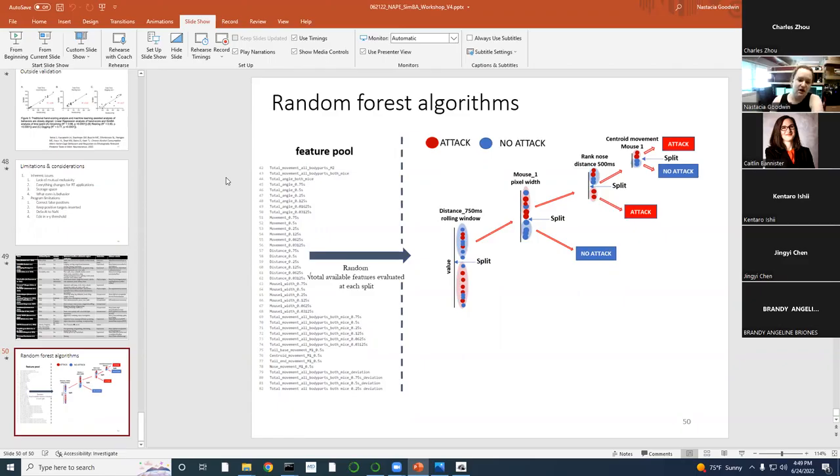So yeah, if you have a training set that has only one animal grooming, and then you add in new videos that have two animals grooming, it will probably get confused. Yes. But in that case, you just add examples of animal 2 grooming, and you say that those are not grooming, and you retrain your model. It really easily splits, and it understands that, okay, I'm looking at these physical parameters, but only in mouse 1. I see. Got it. Thank you so much.